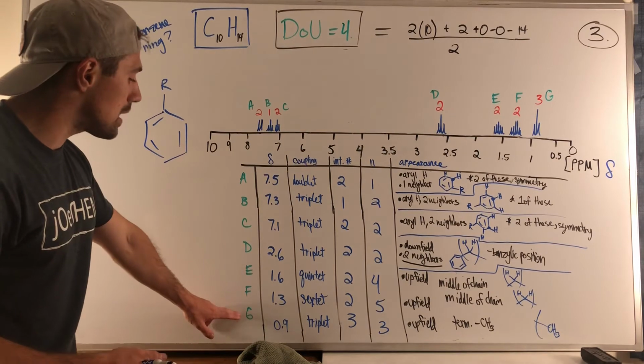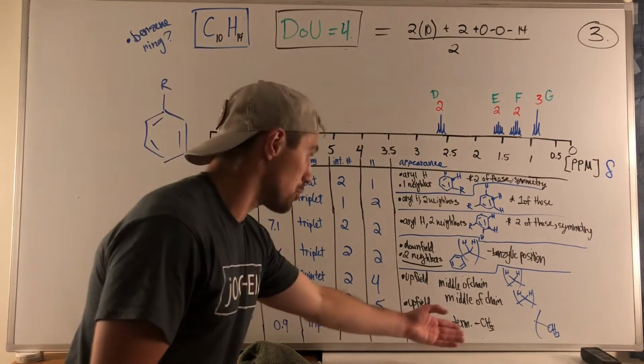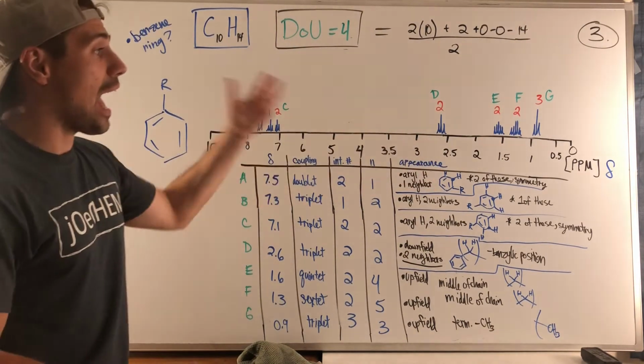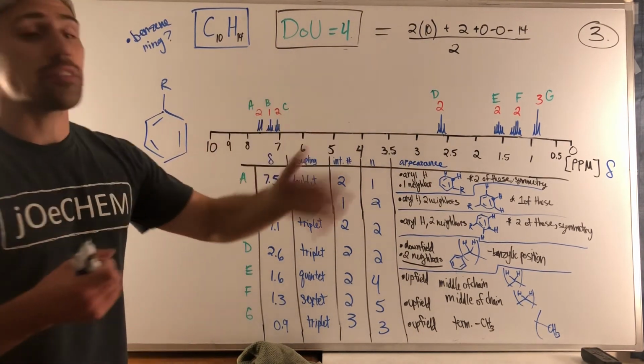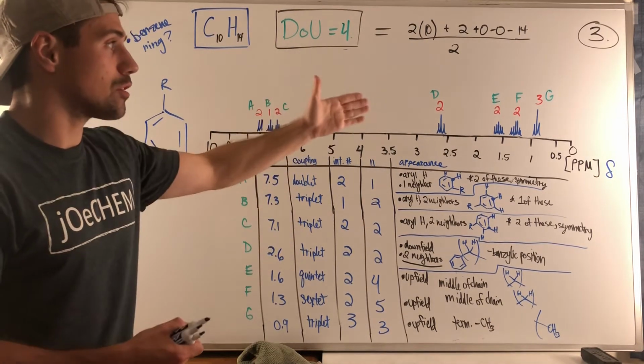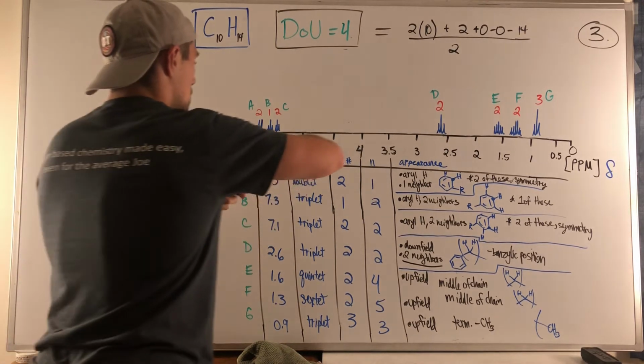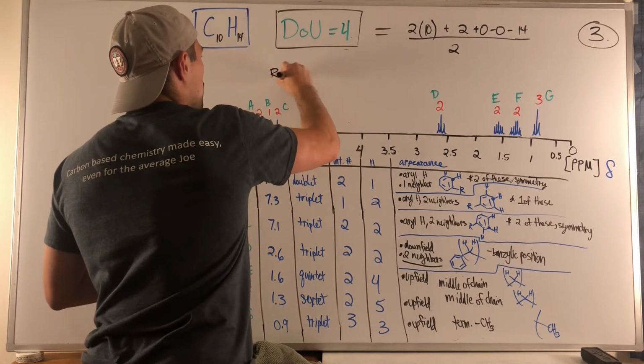So luckily, I think we can identify what the tail end of this is. We have a methyl group. It's a triplet at 1. So as opposed to some other examples we've done where that's been a singlet or a doublet, here we truly have a CH3 that's going to have, what we can even do is kind of construct the R group over here.